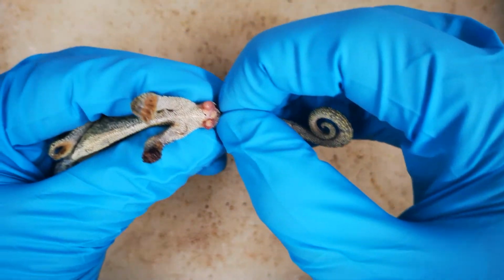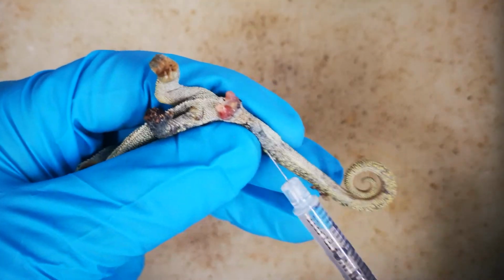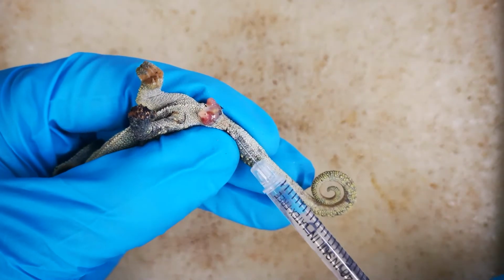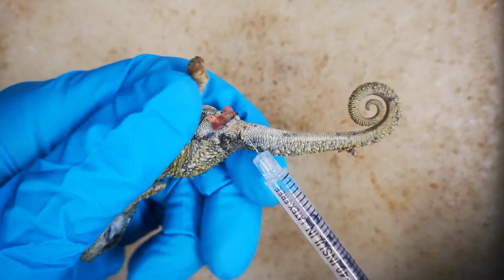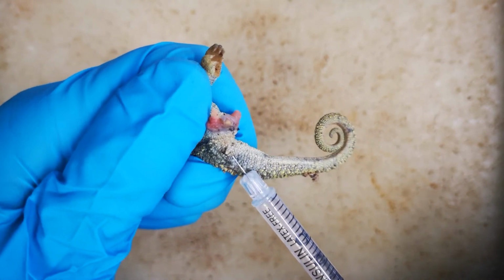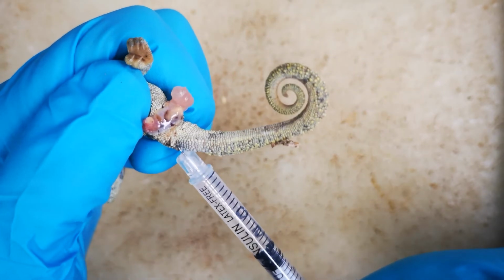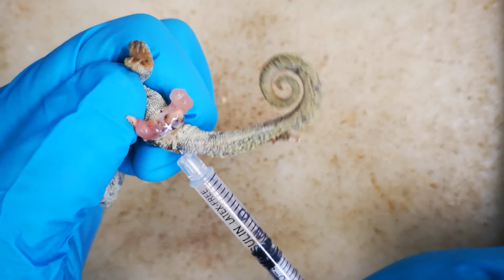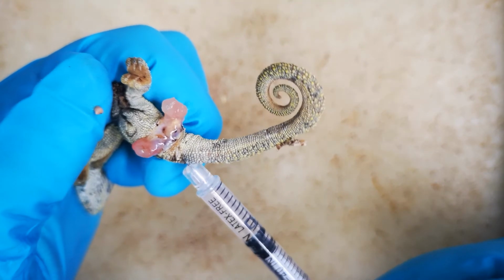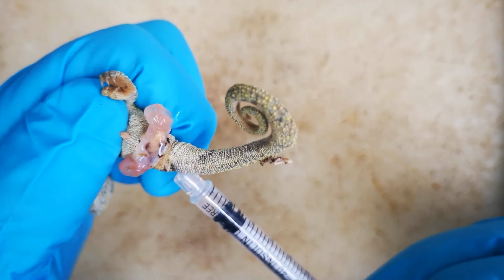To fully extrude the hemipenes, we will first use a syringe filled with water. You can also do this with high concentration ethanol straight away, but it is less forgiving of mistakes. The syringe is inserted toward the back of the hemipeneal sac, oriented anteriorly so that the fluid is pushed into the hemipenis. It is useful to apply pressure at the hip joint to ensure that the fluid does not simply fill the body cavity, but is really directed into the hemipenes.